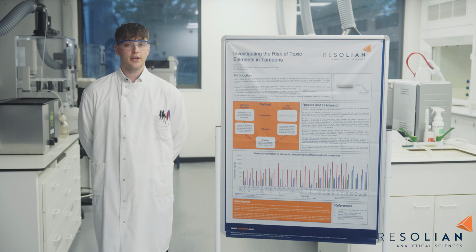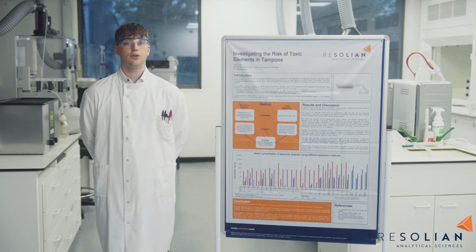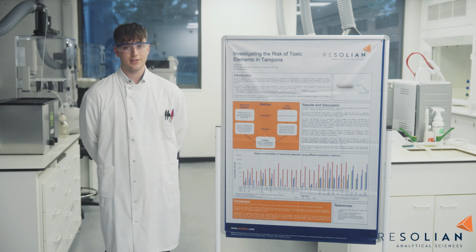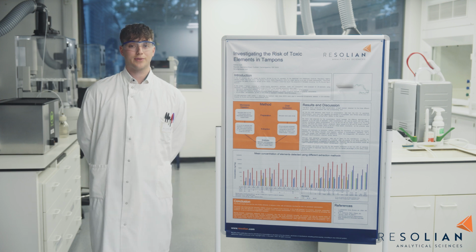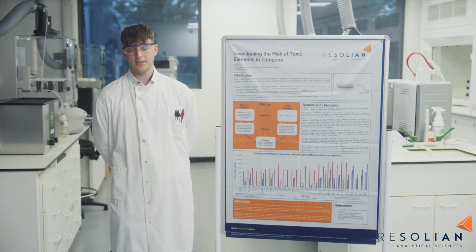This poster shows that there is a large difference in results depending on the extraction method chosen for analysis. It is important to think about the types of results needed. If a complete elemental composition is required, then acid digestion can be very effective. However, a more accurate representation of the risk of medical devices is achieved by simulating the conditions of use, or even by an exaggerated extraction.